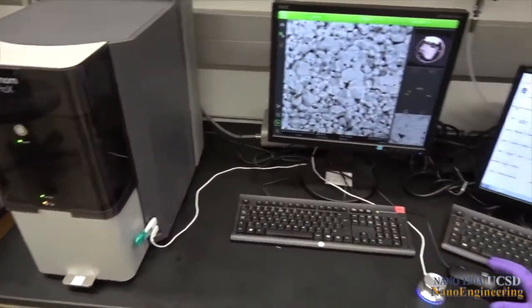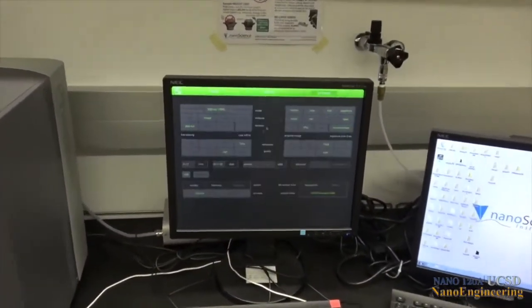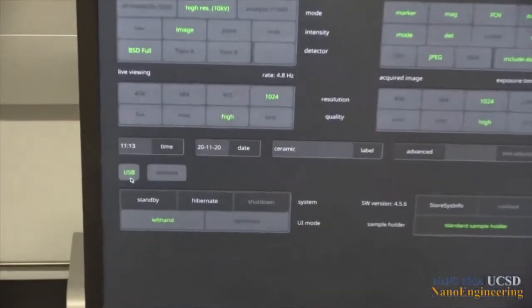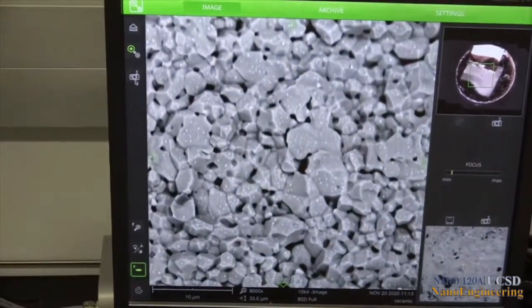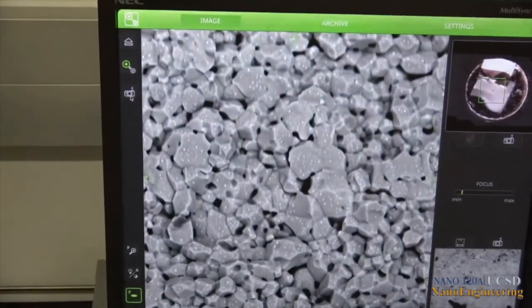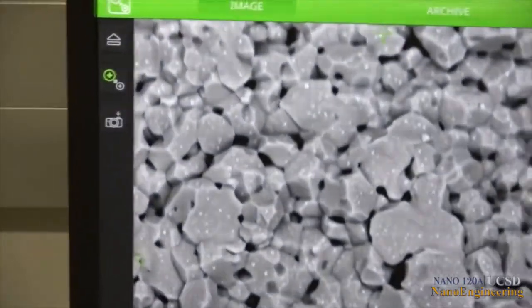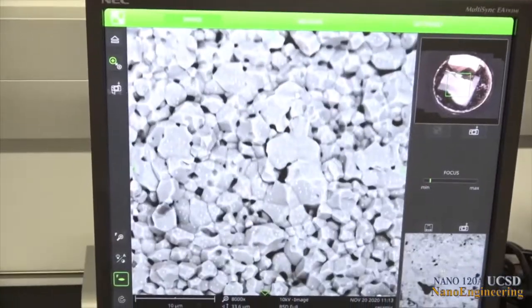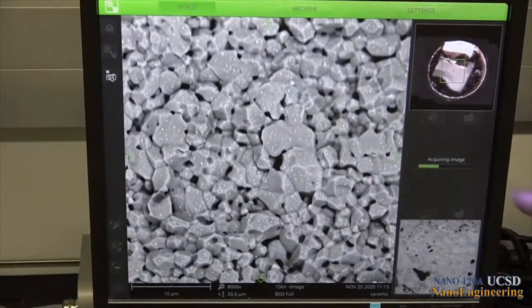Once we insert the thumb drive or memory stick into the USB port, both the USB menu in settings and the camera icon in the upper left of the viewing screen will be lit. After setting your required image parameters in the settings menu, clicking on the camera icon will capture the image. The status of the image capture is shown at the right hand side of the screen.